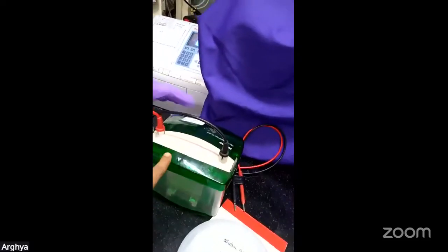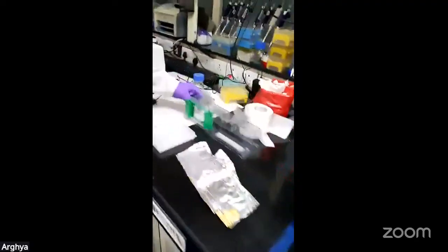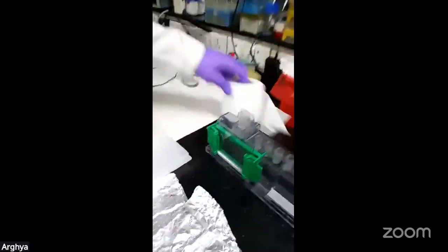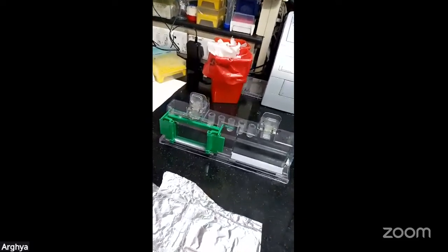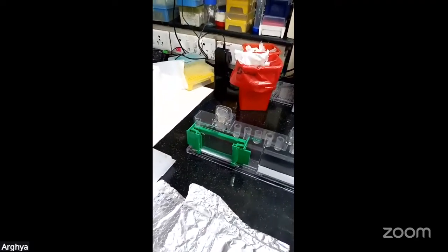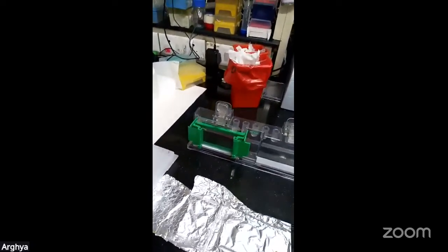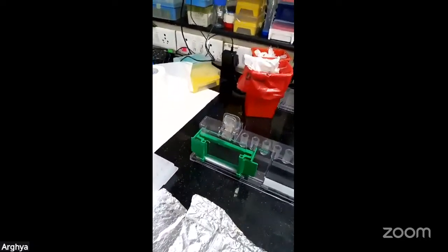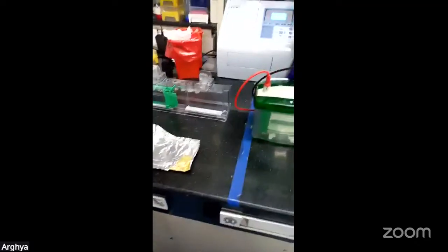This is how a standard SDS gel apparatus looks like. In two-dimensional gel electrophoresis, this becomes the second dimension of the analytical separation. And this is how the gel can be cast. Depending upon the objective of your study, whether you are doing a pharma application or any other application, you can set your SDS-PAGE from 8% to 12%. You can also change to a gradient base. If you don't want to cast the gels, ready-made pre-cast gels are also available. So as per your need, you can cater the needs.